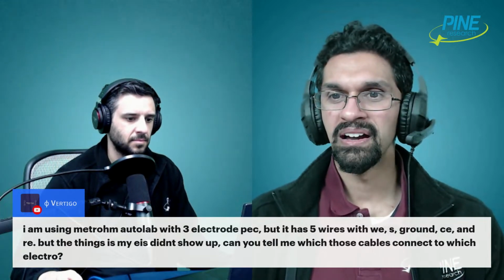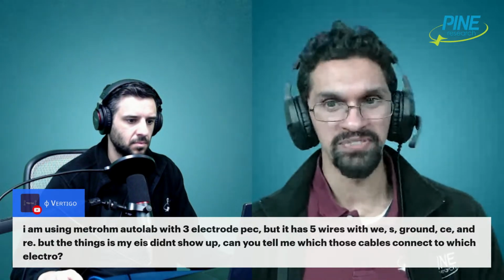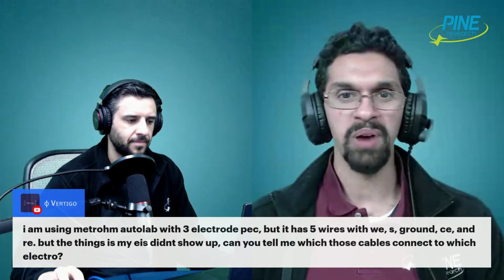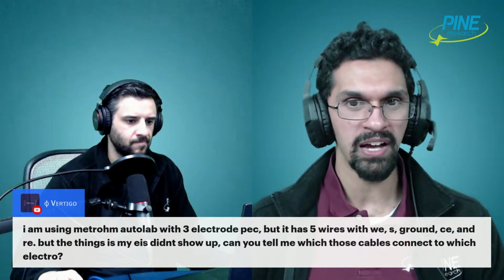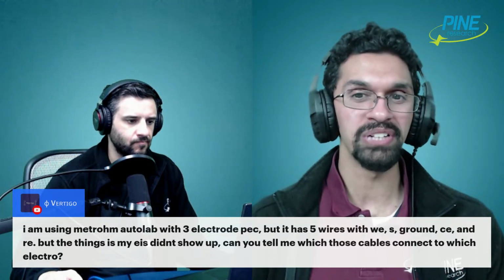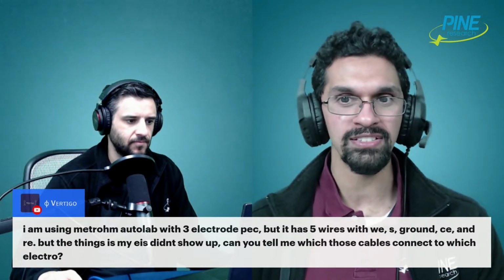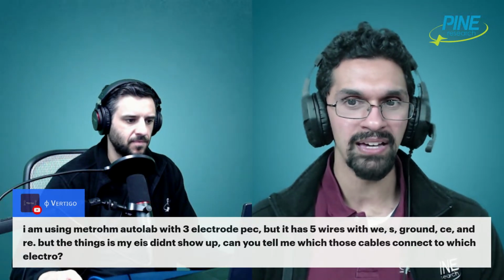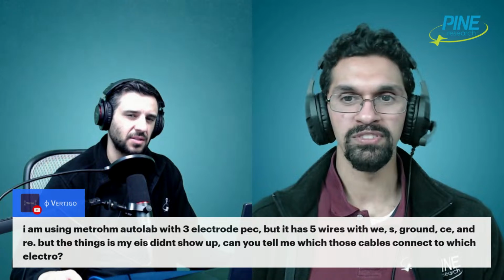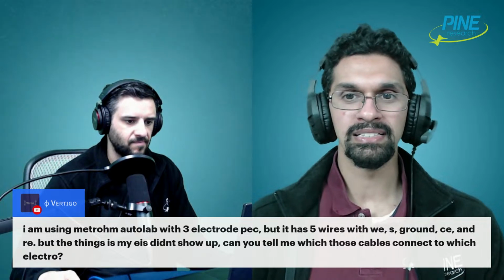Well, I would say you should talk to Metrohm specifically about it, because they're colored differently, so they probably mean different things. It's probably also in the Autolab user guide, just to double check and confirm. As an initial guess, WE is probably the working electrode. S might be the sense line for the working electrode. I think that's correct. If I remember, I used a Metrohm in graduate school. So you're going to want S and WE connected together.